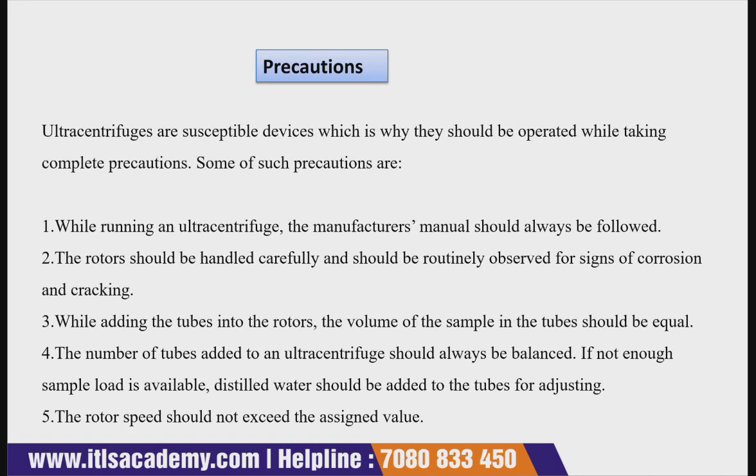Now let's come to the conclusion part, and let's see what precautions you should always take. Ultracentrifuges are delicate devices, which is why they should be operated with complete precautions because of their high speed. While running an ultracentrifuge, the manufacturer's manual should always be followed.